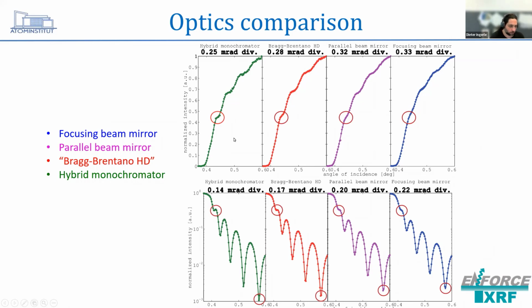In this case, it was a nanometer nickel layer on silicon, and this caused this intensity, also these fringes, and also in the fluorescence signal it's clearly visible that for this smallest divergence optic, it's still a step function here, but here it's basically gone almost, and also here you can see a small peak actually, whereas here it's just dropping down.